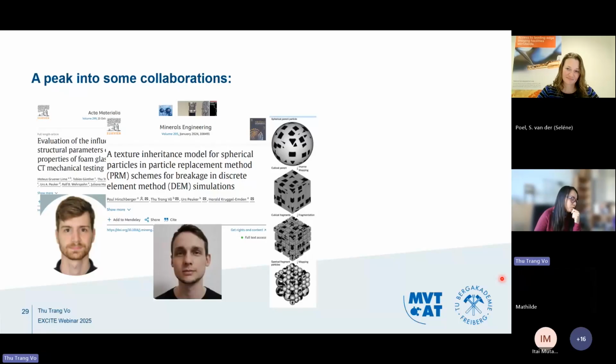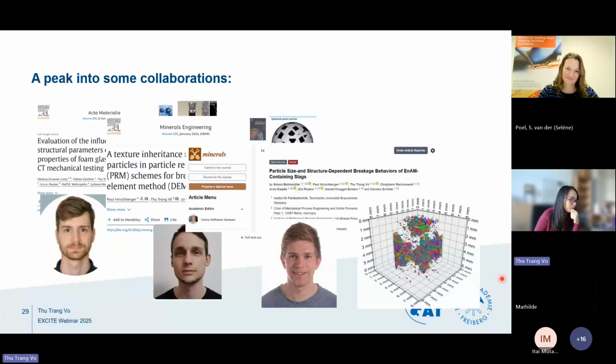This is a collaboration with Berlin. And we also characterized when our target material comes in clusters, not just as one target material. Now it's multiple ones within a bigger agglomeration of minerals, and how we can analyze this.